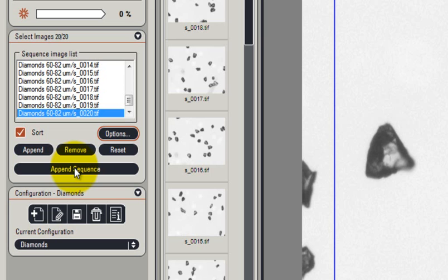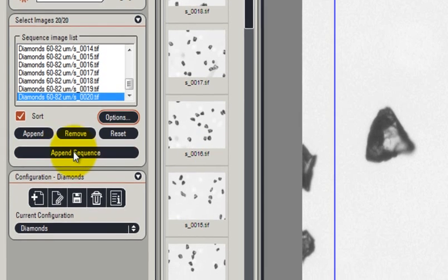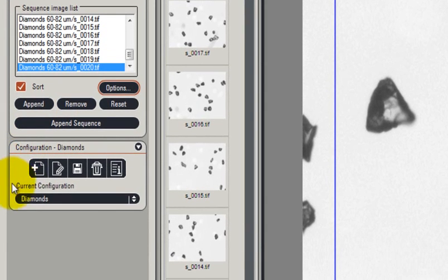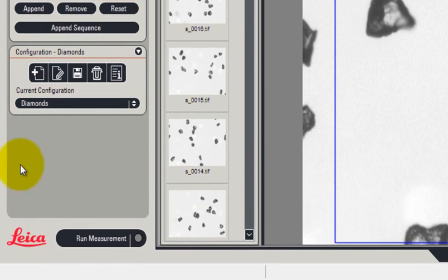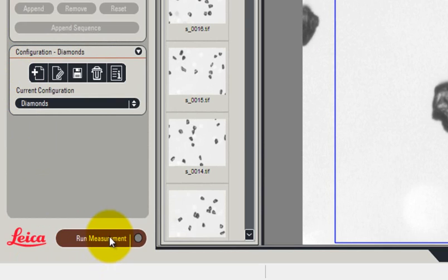And I've already created a configuration. The configuration is called Diamonds. So we're now ready to run the measurement by clicking the Run Measurement button.